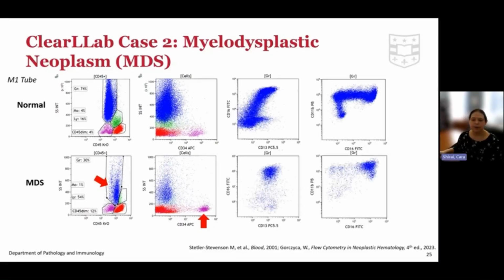Dysplasia or abnormal differentiation of granulocytes can also be observed in this patient's flow cytometry when reviewing mature neutrophil antigens, CD13, CD16, and CD11b. In the third column of graphs, CD13 is on the x-axis and CD16 is on the y-axis. A normal neutrophil maturation pattern is shown in the top graph, which resembles a Nike swoop turned on its side. The MDS patient scattergram notably lacks granulocytes in these various stages of maturation.